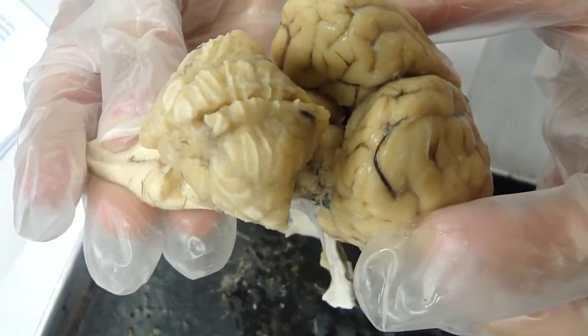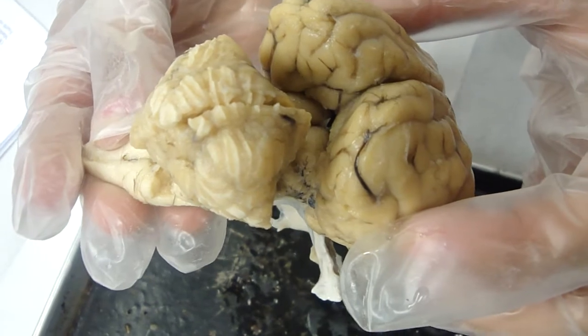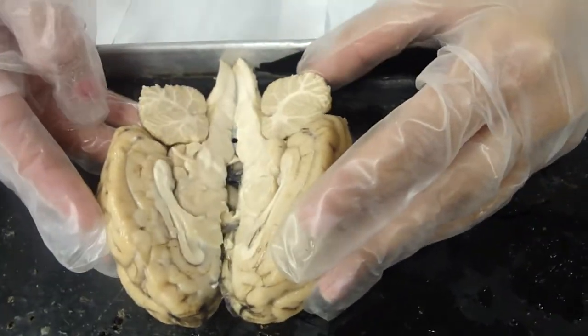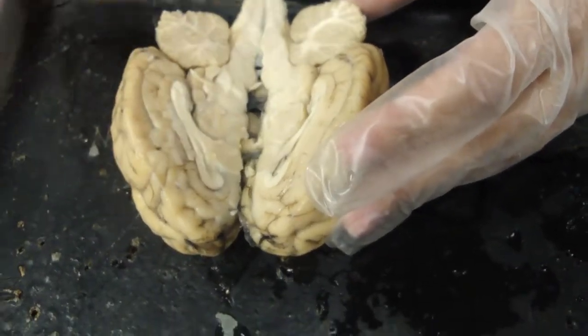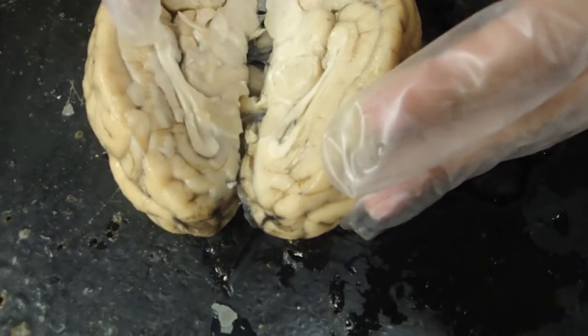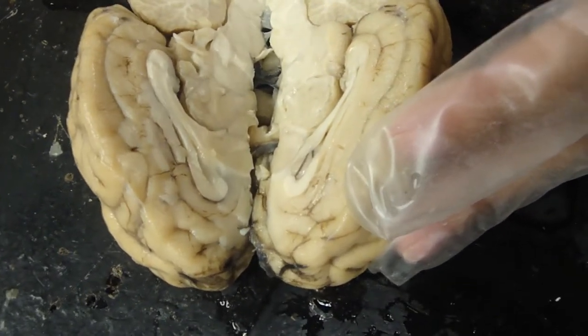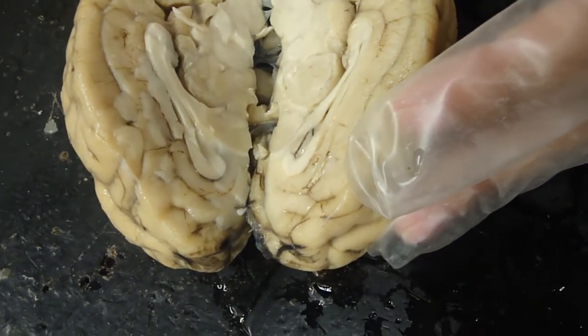There are a couple of very tiny structures that you need to be able to locate. The first one is called the anterior commissure. It's right there on the sheep's brain. All it is is a teeny tiny small dot of white tissue. It's a tract, a place where this half of the cerebrum is connected to the other half. And there's just a small white dot.